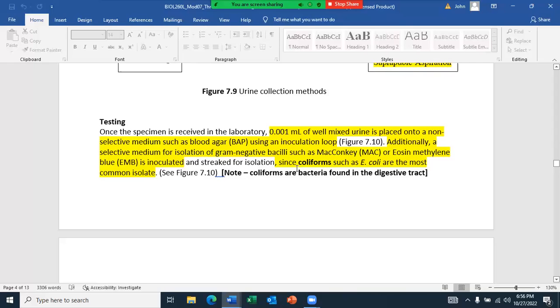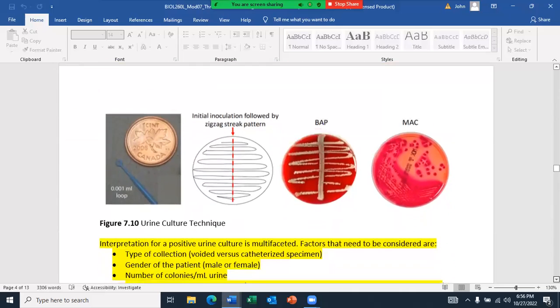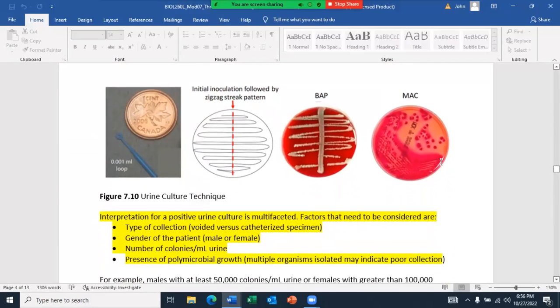And other coliforms also are common. And when we put in all of the enterics, and maybe the Pseudomonas as well, it's over 50% of the species. Anyways, E. coli is the most commonly isolated bacteria causing a urinary tract infection. So we grow it on MacConkey as well.